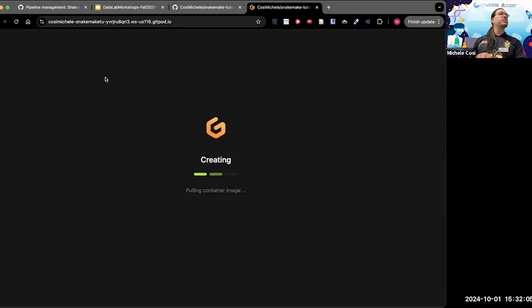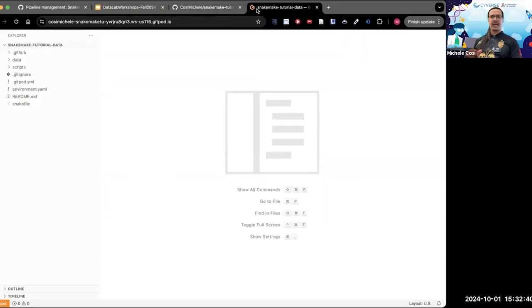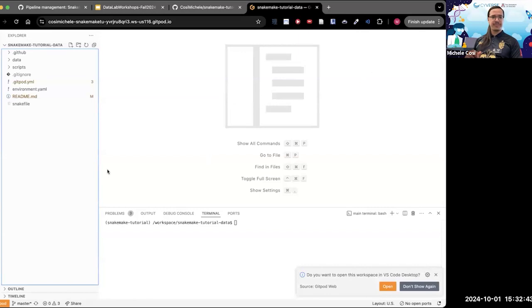Seems like mine is still, there's like a setup. Seems like I set up a bunch of things. You have to do a lot more clicking? I did. Okay, then good, I guess. Whilst people are clicking through things, I can let mine run. Sarah, are you able to? Yeah, I also had to click through some more, like connect to your GitHub. They're making you set things up, so not there yet. Okay, well, it seems like it's loading. So I'm going to give people a couple of minutes perhaps to get to this point before continuing. I'll be back in just a minute.